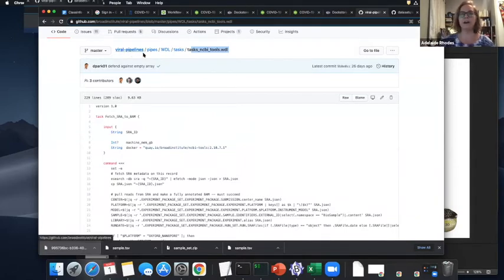It's in a publicly maintained pipeline dataset that feeds into the workspace. So somebody's been doing a very good job with documentation, and they've been keeping the GitHub to Dockstore to Terra going very seamlessly, right? So anytime an engineer is changing the GitHub, it's going to hook into the Dockstore, it's going to hook into Terra.